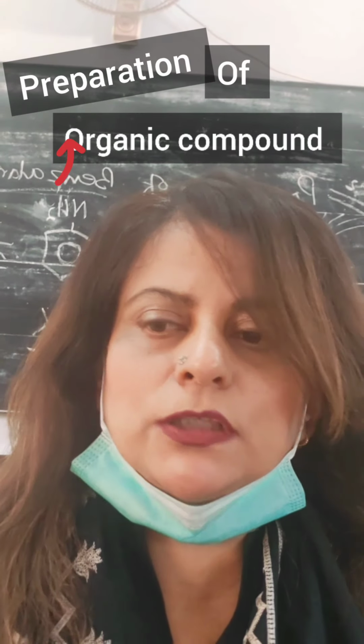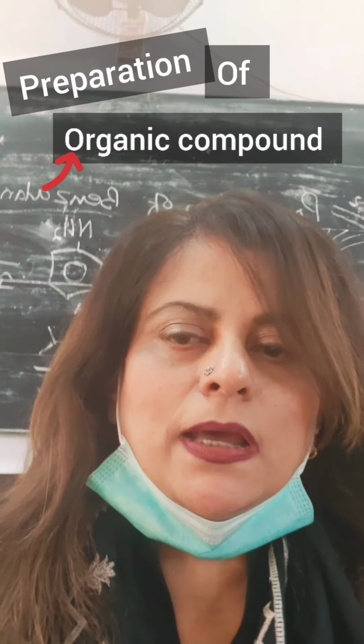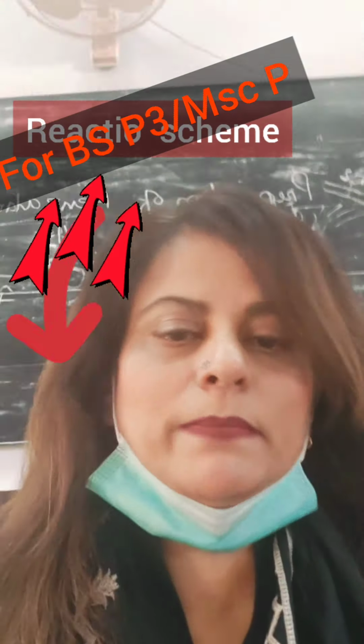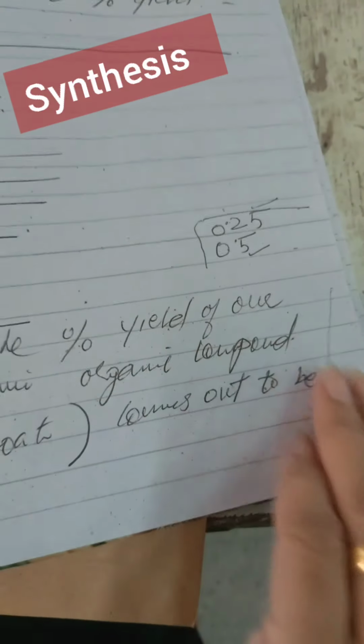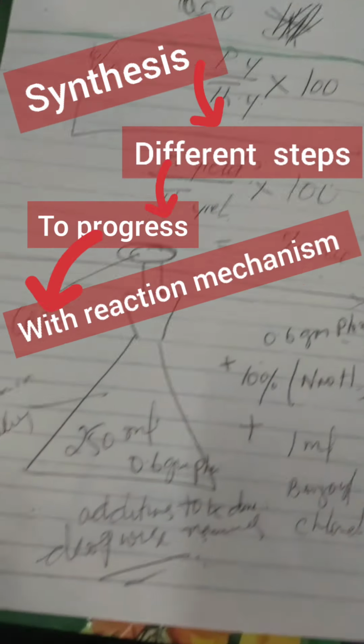Part 3 BS lab, and I have explained to them the whole process and the reaction, because I'm here for the practicals. I've explained the reaction scheme to my students, and I can show you how they have done it. This is how I explained it to them on the register, my way of explaining how they are going to do it.